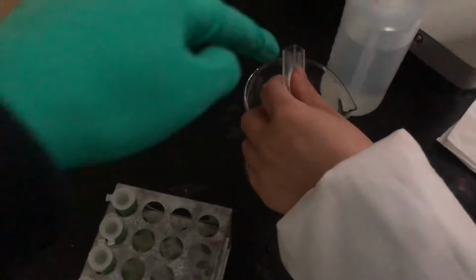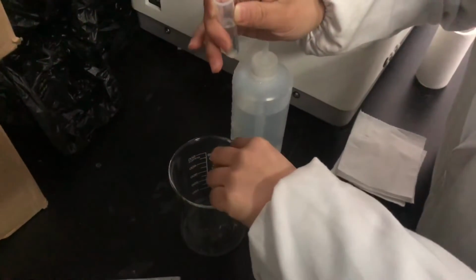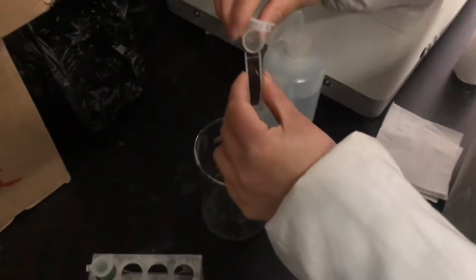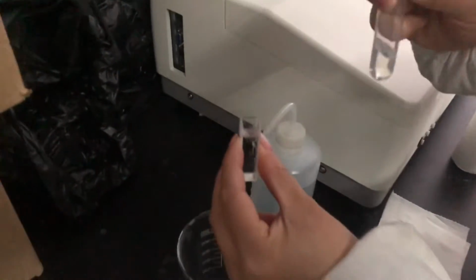We put this and then rotate. Okay. We do this about 2 or 3 times. Okay. And pour. Okay.